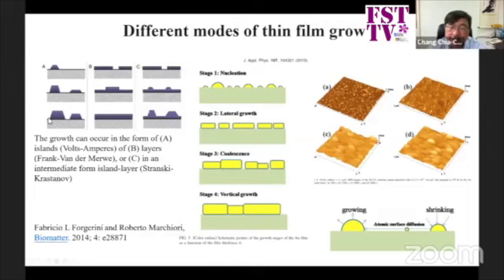At the same time, since it's an electrode, those islands and their substrate need to be conducting. So it's important to generate an SK-like surface, and this kind of SK model may take place around 1 or 2 layers of metal sputtering.